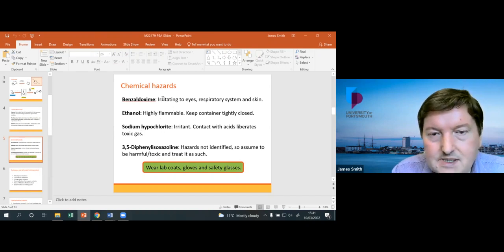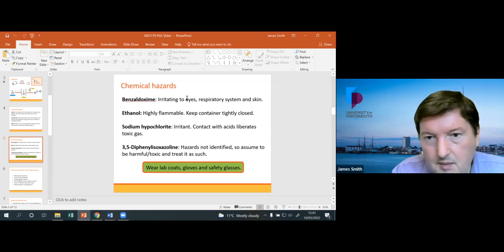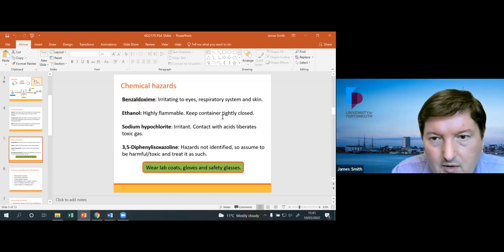There's another list here, the benzaldoxime, irritating to eyes, respiratory system, blah, blah, blah. Ethanol, sodium hypochlorite. It's basically bleach, isn't it?